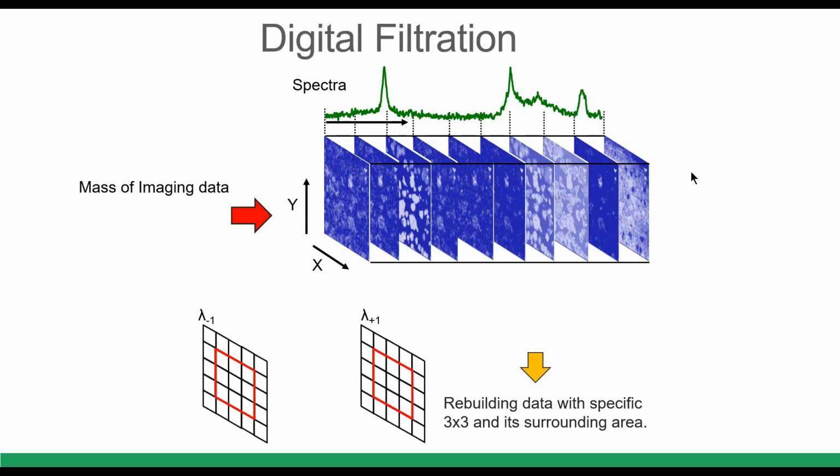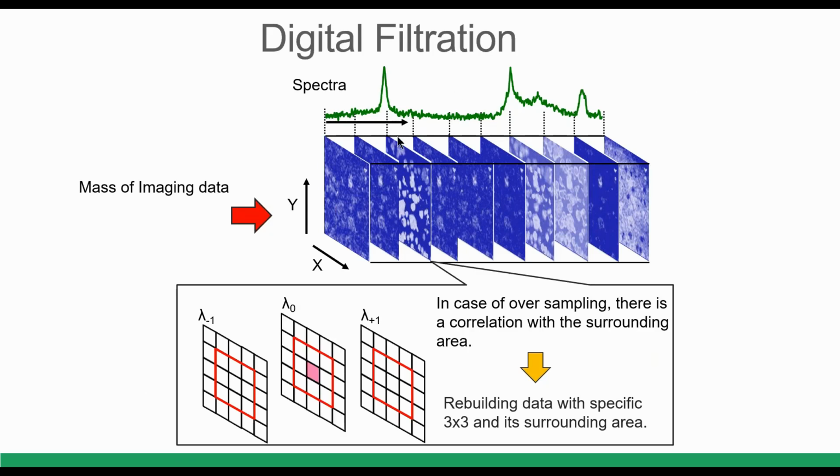And actually, what it's just doing is creating or enhancing this image based on the information of the image of each spectral band. Actually, what it's just doing is collecting enough information to make these maps with a better edge, reduce the noise, increase the signal to noise. That is actually what we are doing in this step.